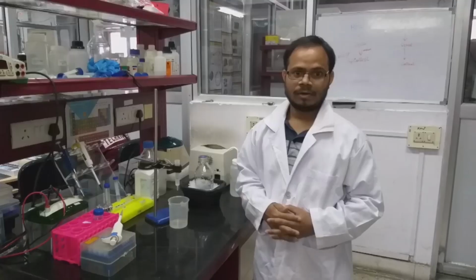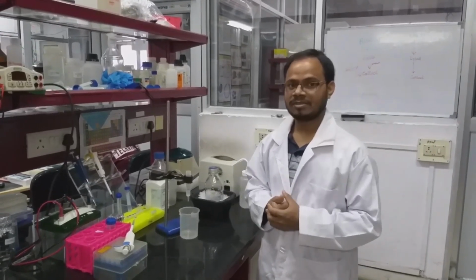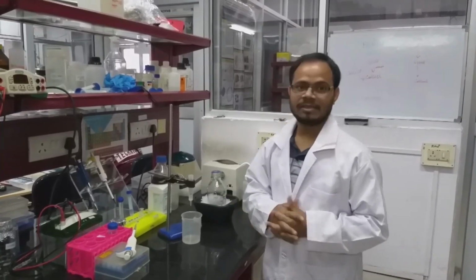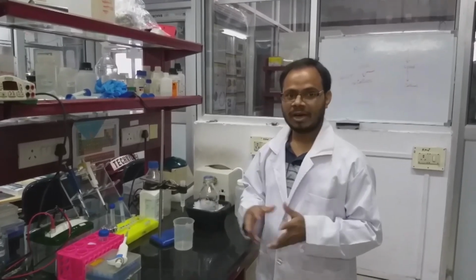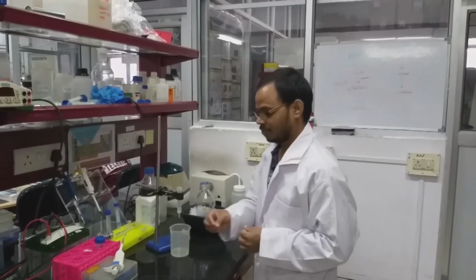Before equilibration of the column, we have to charge the column. For nickel NTA, there are two types of beads. One is already readily charged beads which come from the company, and another one we have to charge. They will give only NTA agarose beads. So here we will charge the beads with the nickel, and then we will equilibrate. We already washed the column with water and 0.2 normal NaOH, again with water. So now we will equilibrate.